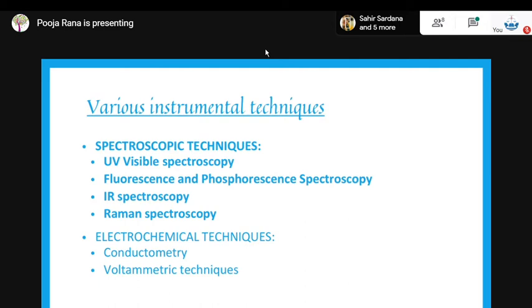So how are you going to distinguish between those two? It might be present. It is a possibility that water might be present, or some other sort of chemical might be present. All right. So how are you going to distinguish from that? For that, we flash a UV light on it, and urine gives back the yellow colored fluorescence. So that particular phenomenon which is occurring over there is called fluorescence.